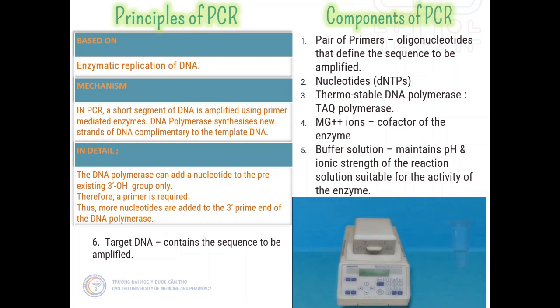Then we design primers for the target of interest. The primers are like bookends to a specific region of the viral genome. A primer pair will allow the amplification of as little as one RNA viral genome. It can convert into billions of copies that can be detected. Each round of amplification uses a DNA replication enzyme to copy whatever DNA has a primer pair. We typically do 30 to 40 rounds of PCR amplification.